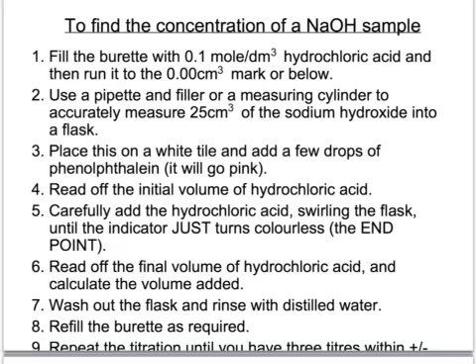to accurately measure 25 cubic centimetres of the sodium hydroxide into the flask. It's the sodium hydroxide that we don't know the concentration of - that's what we're trying to find out. Put it on a white tile so you can see the colour change and adding a few drops of phenolphthalein indicator will make it go pink because that's the colour for alkali.